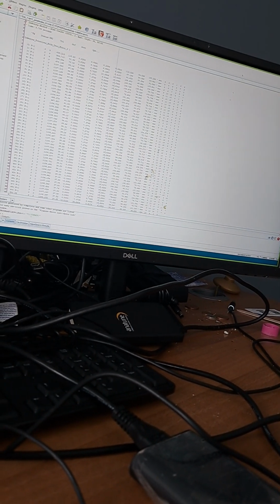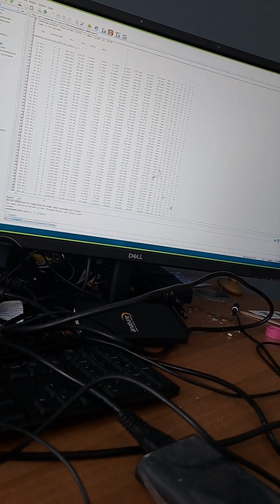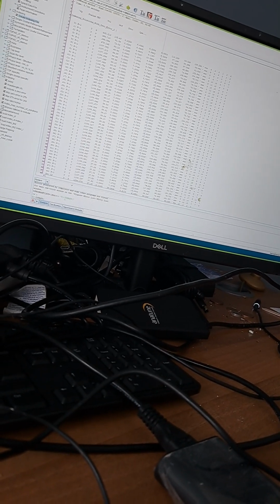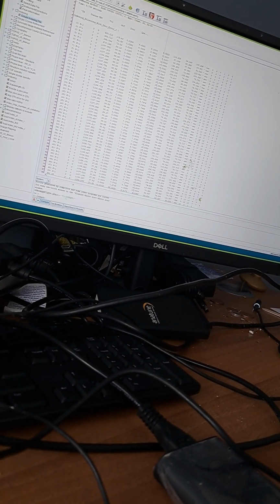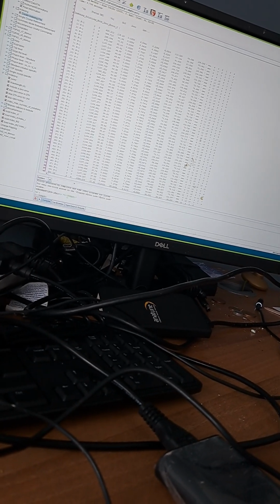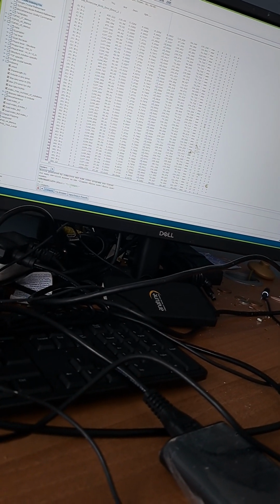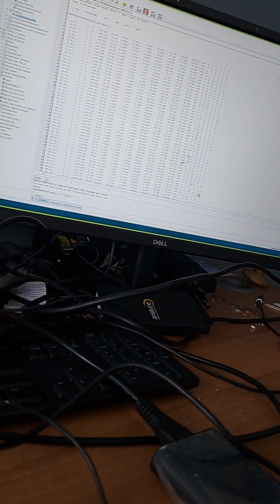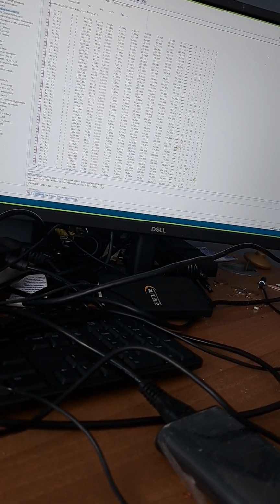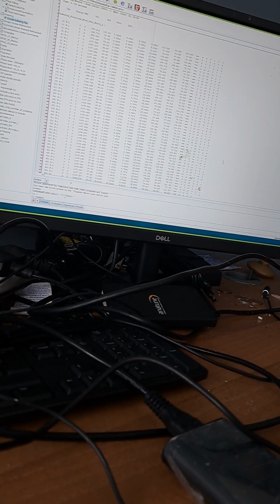Okay, so at the top there, then you've got potential indexing of the sample. Yes. So that's obviously 115 goodness of fit, so that's pretty good. What's promising about these sets, these first two, is that they're sort of similar to one another and the same sort of numbers are coming out. Yes. They're not the same unit cell because you can see that the volume's changing. But obviously it's promising anyway. Okay, so what's the volume that we need?